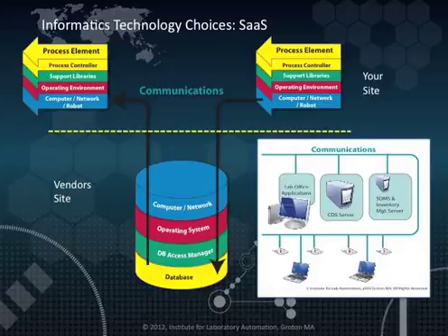While those are significant benefits, particularly for small labs that may not have extensive information technology support, there are some downsides. While technically instruments and other laboratory systems can be connected to these remote systems, from a practical standpoint that may not be a good idea, since delays in network transmission, power disruption, or other failures can alter the effectiveness of the system. Another consideration is system security.